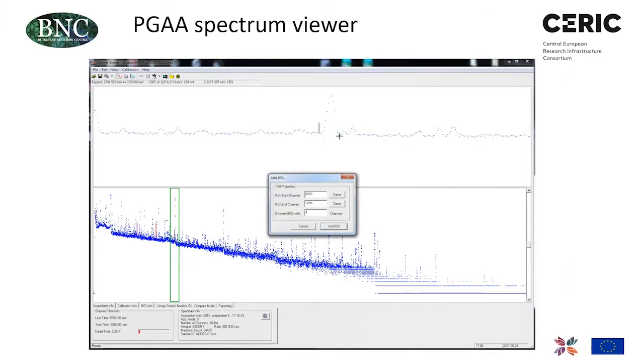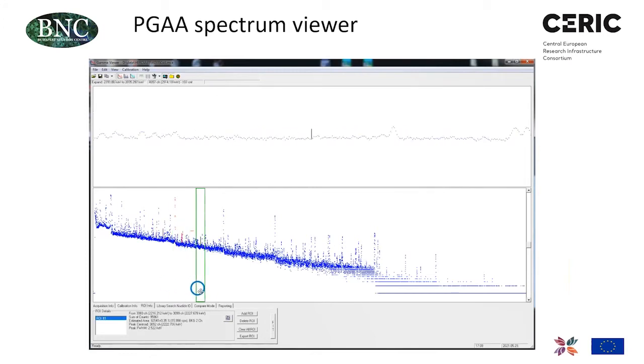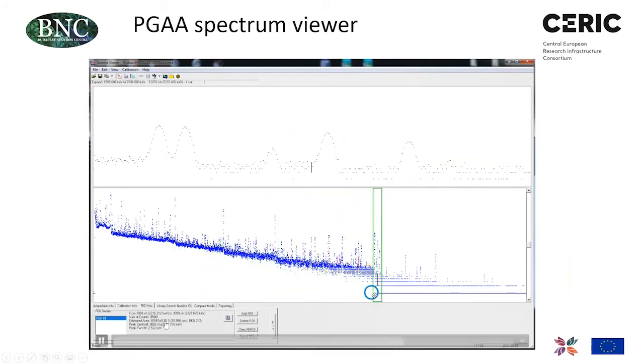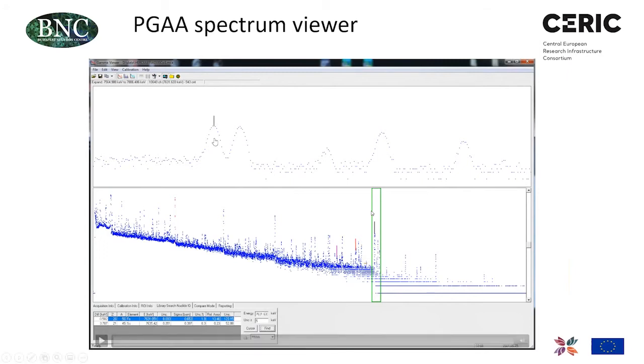So this is a quick and easy way to estimate the peak area. We just simply integrate everything which is above the baseline and get a count. And not only the count, but also the corresponding statistical uncertainties are calculated, which is very important. We have a nuclear library, so we can identify the origin of each gamma radiation from this library. So this peak comes from iron. And here you see the library entries for the energies.